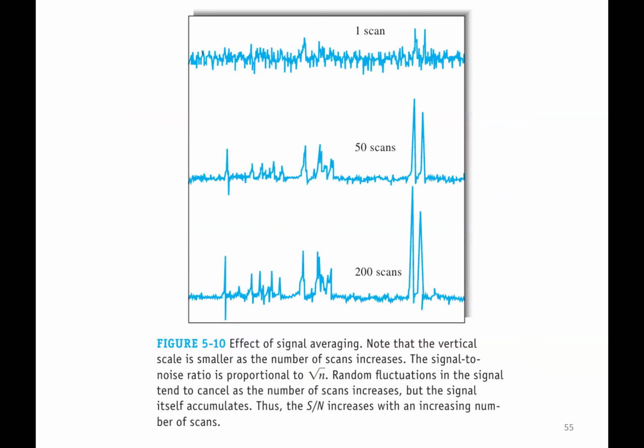This is the same diagram here, and this is ensemble averaging. Remember, software does that. Many scans, average them. The algorithms are there to do that for you. The other one is boxcar averaging. Boxcar averaging is another way of dealing with spectra so as to improve the signal-to-noise ratio.